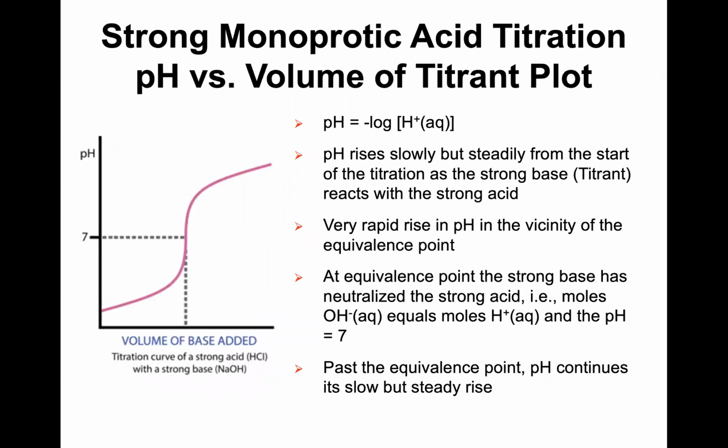So here we use the pH meter. We talk about pH versus the volume. So what is pH? pH actually is a concentration scale.